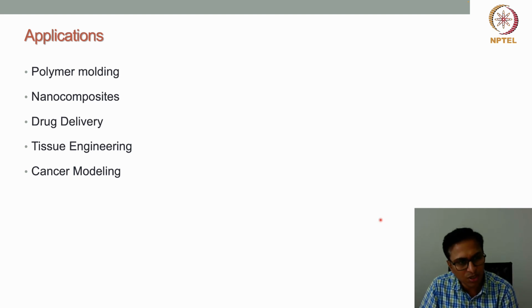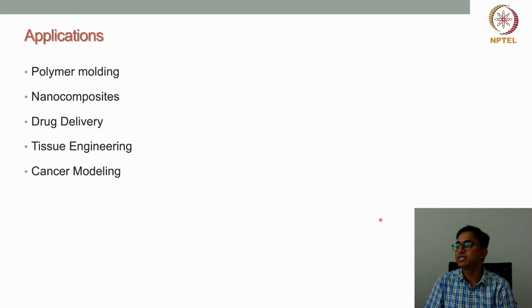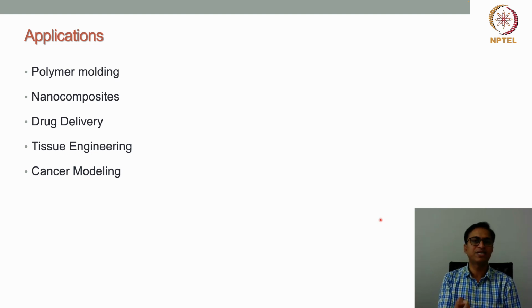For preparing nanocomposites, inkjet bioprinting and inkjet 3D printing are also used nowadays, because the nature of this printing technology is that it can create very fine droplets. By creating these fine droplets, we can create very fine structures or very fine particles, right? When we do this, suppose you want to mix two or three materials together, we can mix them, generate these droplets, and then generate the particles. So composites of nano dimensions can be very well prepared.